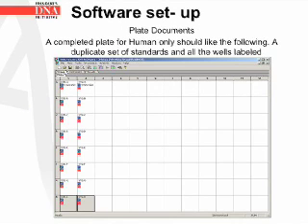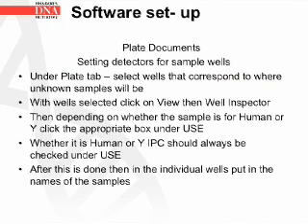This screenshot shows a completed plate for human only, and it should look like the following. There are a duplicate set of standards, and all the wells are labeled. Now that the standards are set, let's set up the detectors for sample wells.